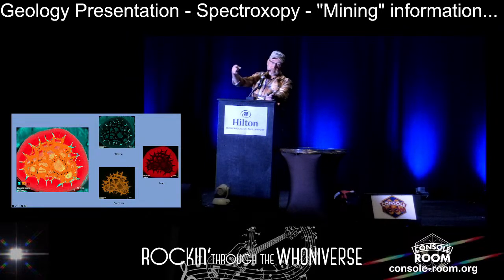It's the same gentleman that gave me the manganese nodule who had what's called an ironstone accretion that he had given as a gift to his grandkids. And here I'm displaying silica, calcium, and iron. Some of you might recognize this looks very similar to what we call a septarian nodule.